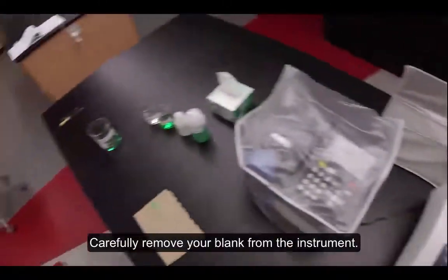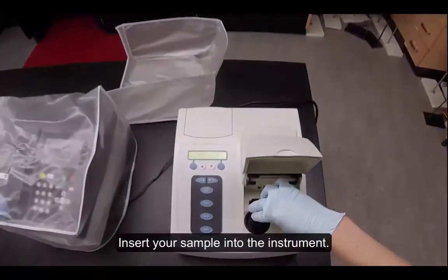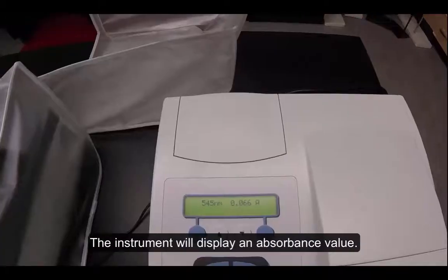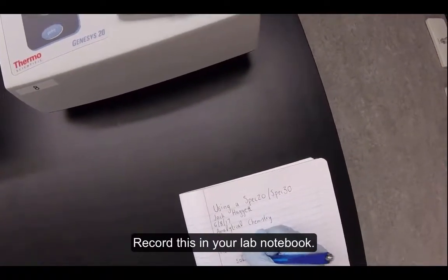Carefully remove your blank from the instrument. Insert your sample into the instrument. Close the instrument without pressing any buttons. The instrument will display an absorbance value. Record this in your lab notebook.